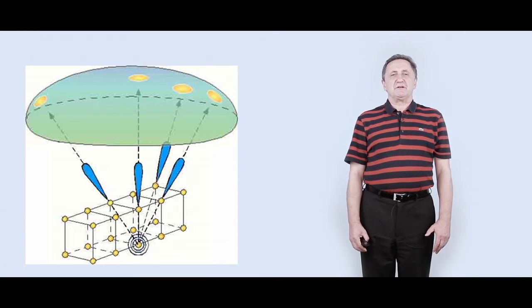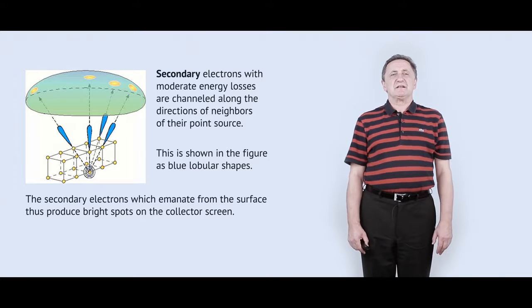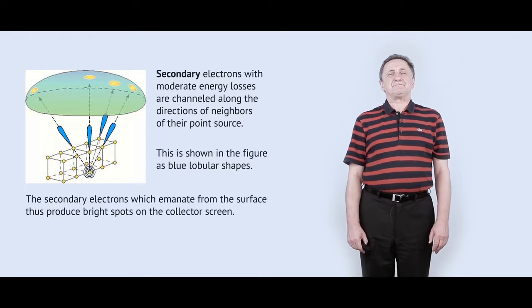In the secondary electron image, the high energy incident electrons interact with some volume, mainly the surface of your sample, and as a result of this interaction, secondary electrons with relatively low energy are formed and detected by the special secondary detectors.